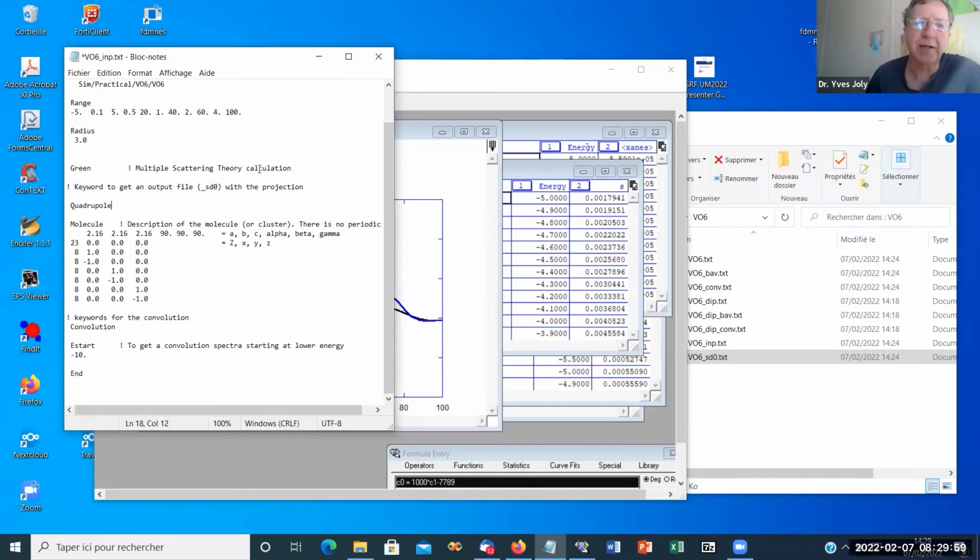Maybe I could mention that you saw that we have calculated the K edge of vanadium and not the L2 edge, for example, of oxygen. So how does the code know that? It's only because by default, the calculated edge is the one of the chemical species first in the list. So it's vanadium. And by default, the edge calculated is the K one.